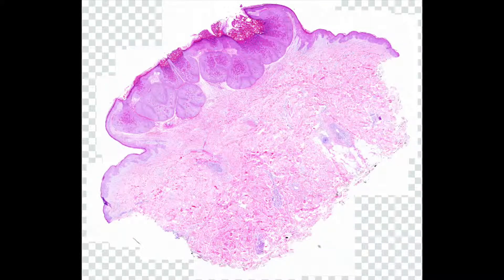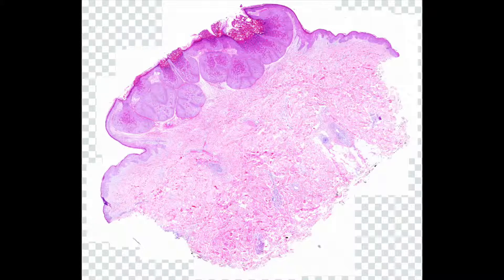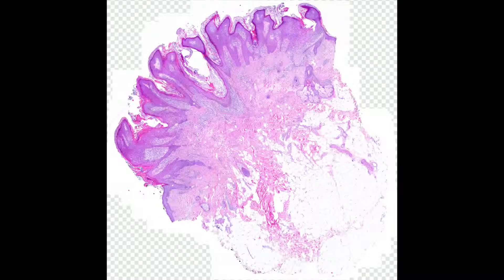Go to File in the menu bar and save to save a copy to your hard drive. In this case, using the 4x objective, the JPEG output of this specimen is 36 megapixels and 18 megabytes in size. In comparison, this other specimen I captured using the 10x objective is 85 megapixels.